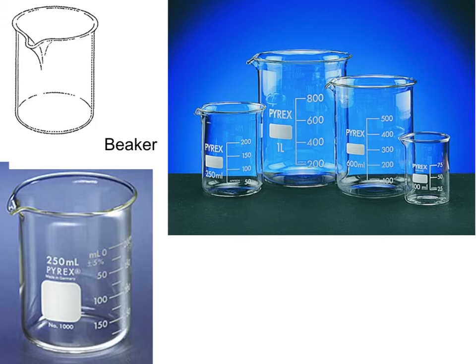This first one we're going to look at is called a beaker. Beakers are characterized by this shape. The ones we have in the lab have this little pour spout that makes pouring easier. Their function is fairly simple — it's simply to store a liquid.